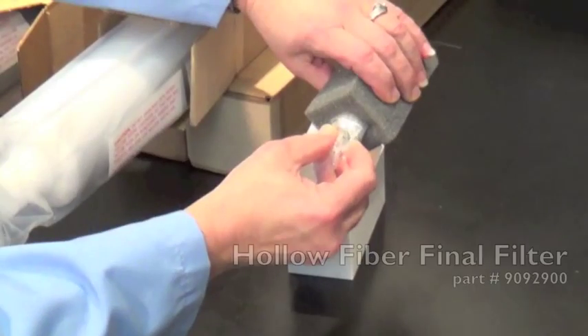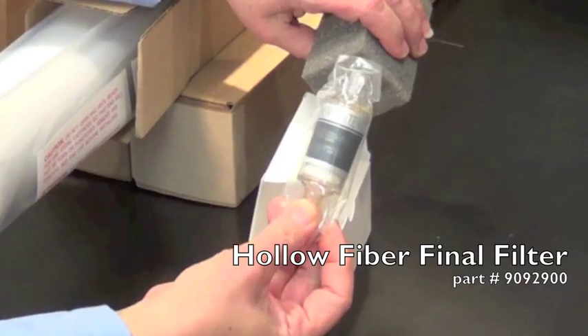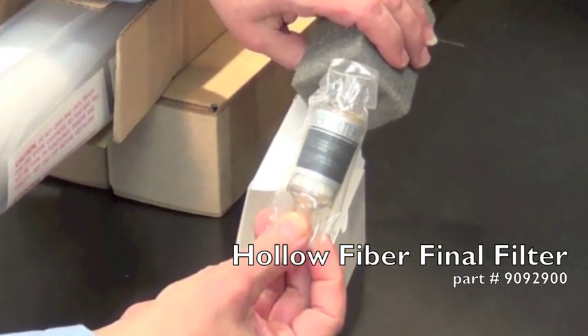A 0.2 micron self-venting hollow fiber final filter can be added to the gun or valve as an accessory when required to dispense bacteria-free water.